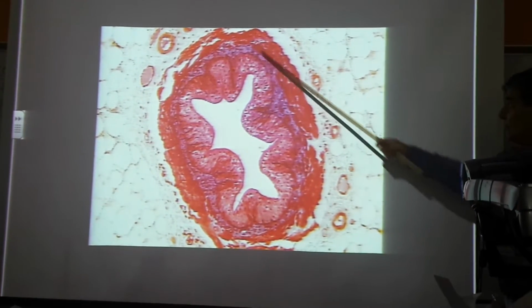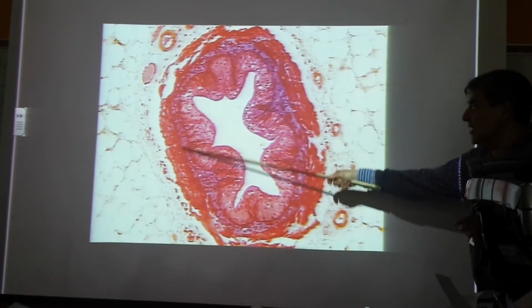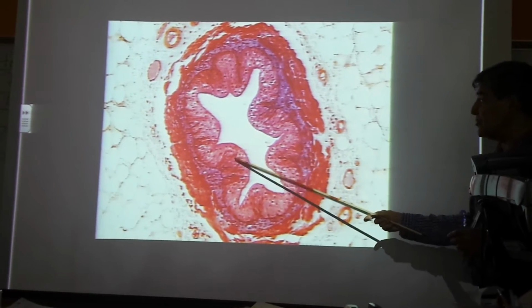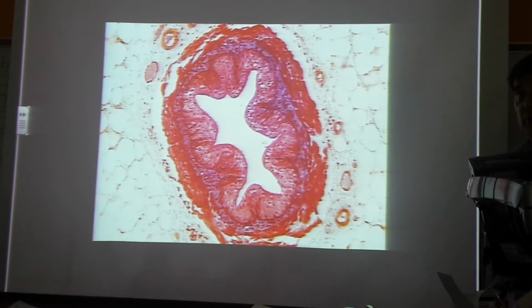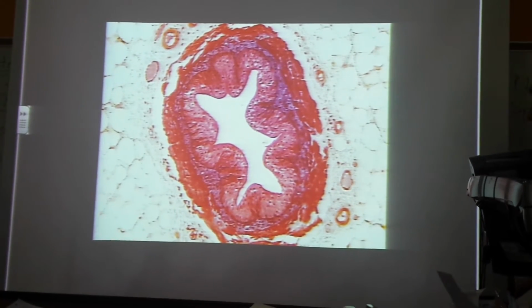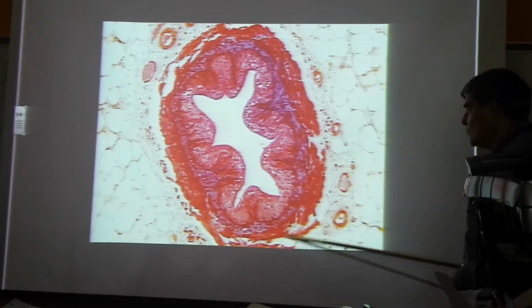Then we've got this kind of bluish, violet color layer. This is loose connective tissue. Now this is mucous membrane. What is a loose connective tissue deep to the epithelium called? We saw it in the GI tract. Lamina propria again. Lamina propria. I said learn that term, you're going to see it again. Okay? Then out here are the muscle layers, smooth muscle.